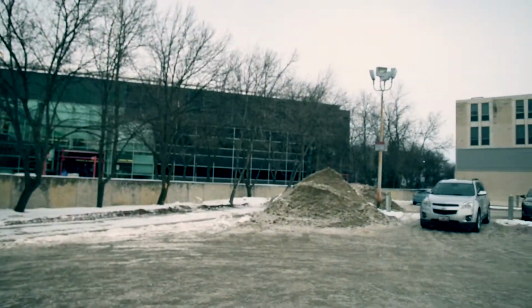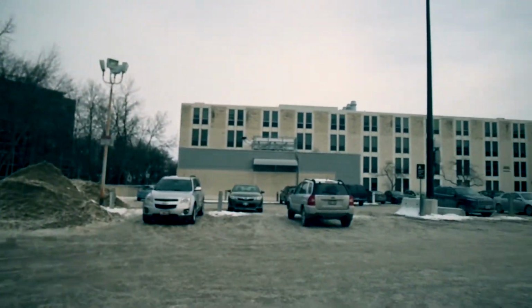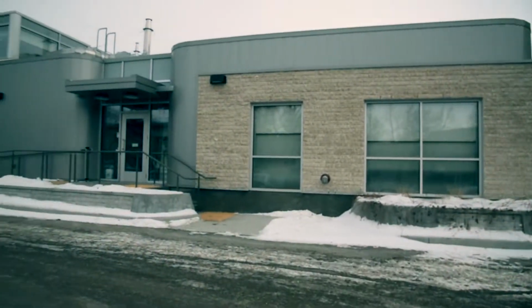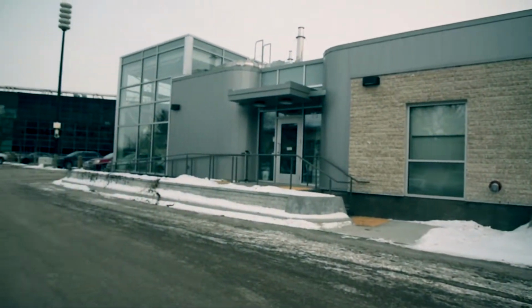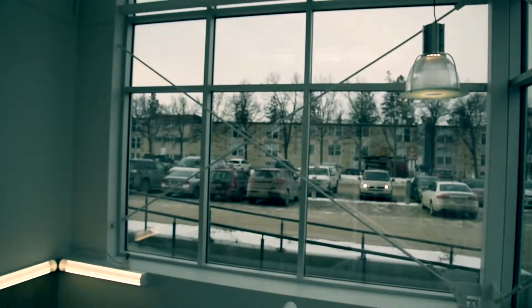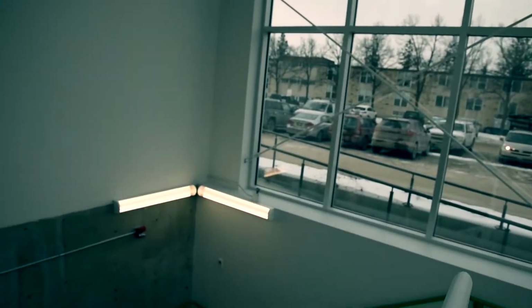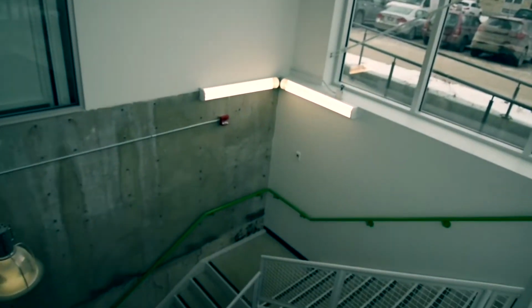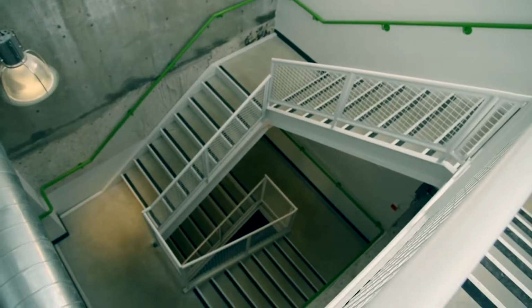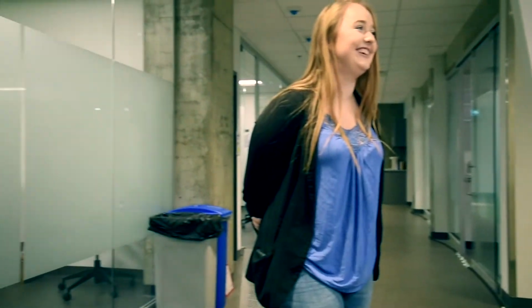Welcome to the Manitoba Institute for Materials in Parking Lot A, surrounded by Parker, Allen, Wallace, and St. John's College. We've had lots of visitors wondering what's in this small building, so let's take a look. We're in the sub-basement, a floor below tunnel level and surrounded by several feet of concrete. This area, once home to a cyclotron, has been repurposed by MIM to host materials characterization instruments.